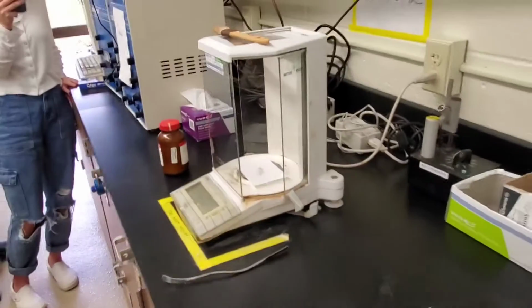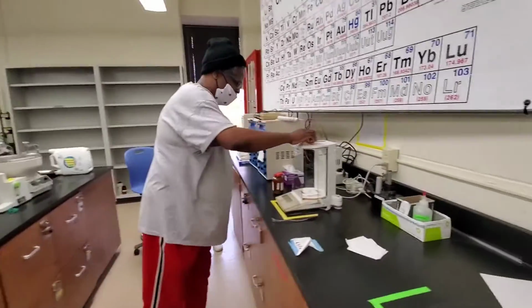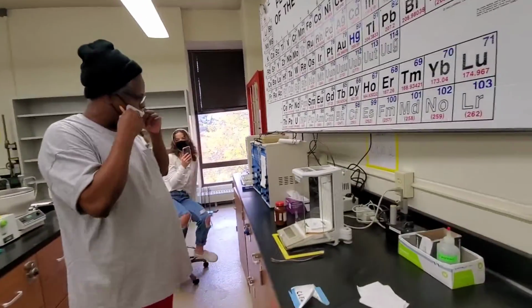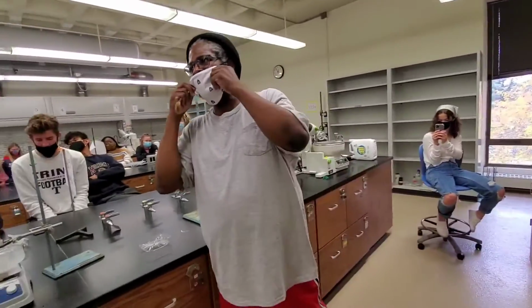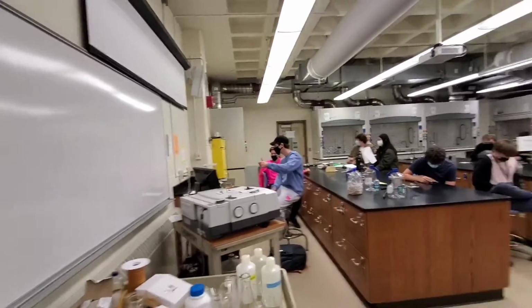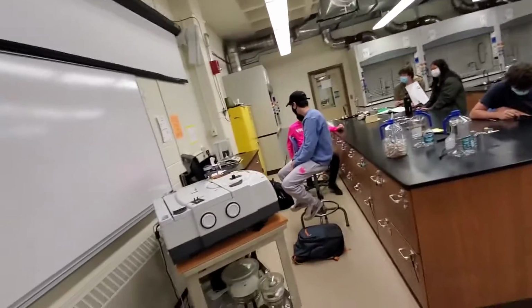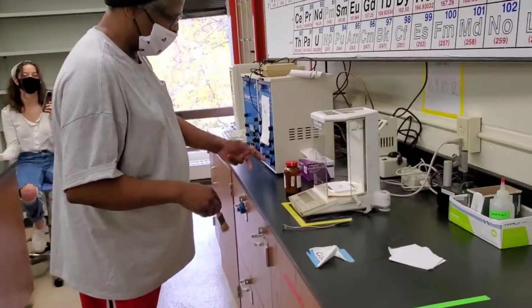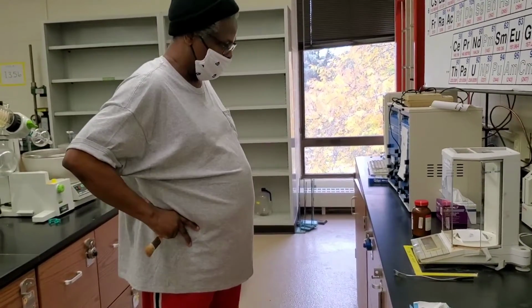This area is fairly clean. We want to keep it that way. The balance here is fairly clean. We have these brushes, and we have other hand brooms and stuff. I don't know if that balance over there looks clean, and the area not too good. I see stuff on the right hand side. So this is all part of being professional in the lab, is making sure when you finish using it, you clean it up for the next person coming along.